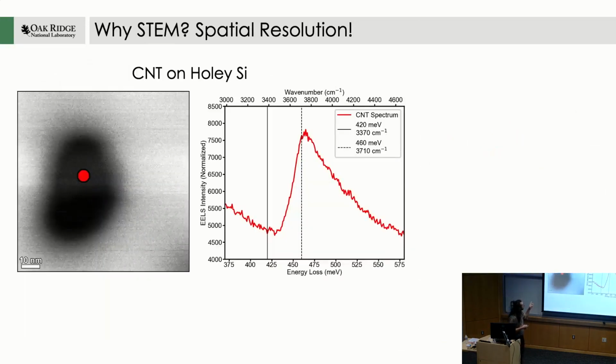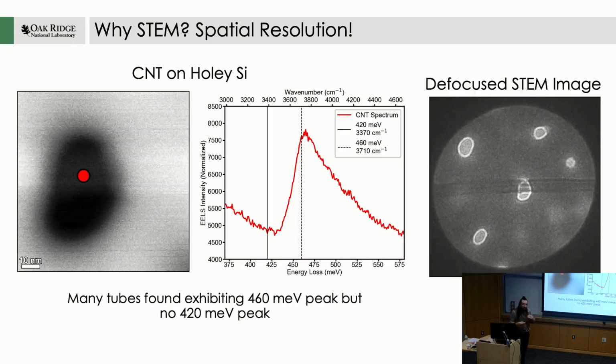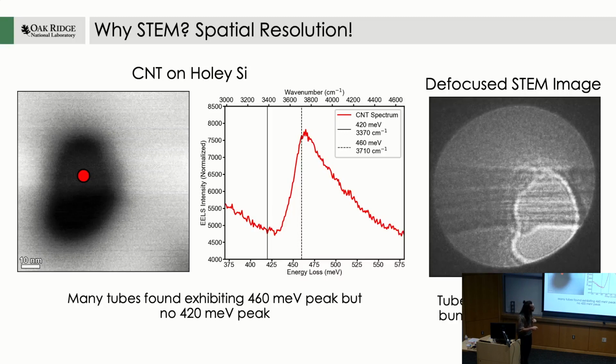One of the things we had to do was go away from this type of sample. The reason is I can look at one of these tubes in one of these holes and I can see my nice 450 or 460 meV peak. But if I go to a more TEM-like mode where I'm more sensitive to the phase contrast, I can see something unfortunate. I don't just have one nanotube here. I have some bundle of carbon nanotubes here. So I don't really know where this signal is coming from because it's a little bit delocalized. We know we're seeing something from this bundle, but what we're actually looking at within this bundle is not particularly clear.